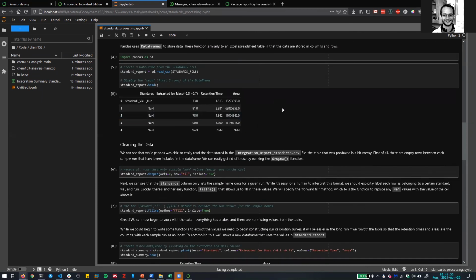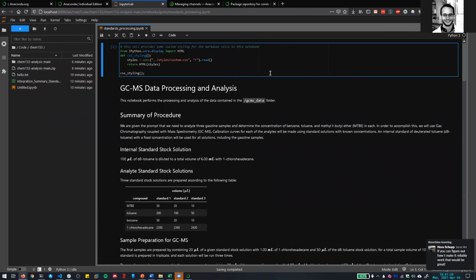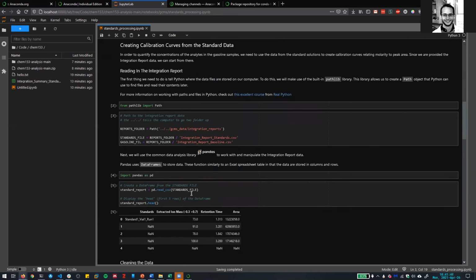So I'm not going to go through all this right now. We'll go through this on Wednesday. But we can get to this point, and I just want to make sure that everybody has a notebook that is able to run these things. So Richard, were you able to get the pandas import to read as long as you ran these cells in order?